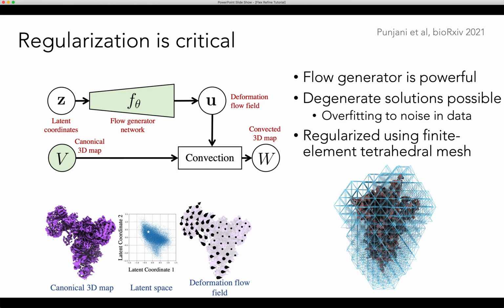And one example of that is the spike protein of the COVID spike protein. The spike protein has a base region, this conical region at the bottom, and it also has 3 N-terminal domains and 3 receptor binding domains at the top. Those domains are all connected to the base, and they're all flexible.